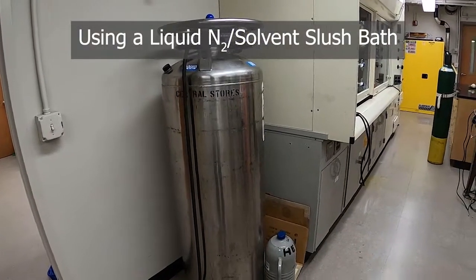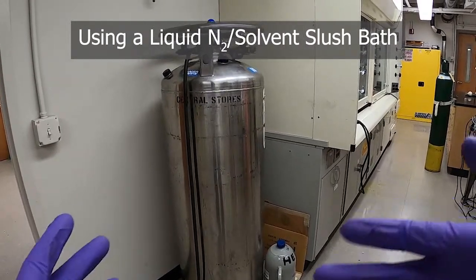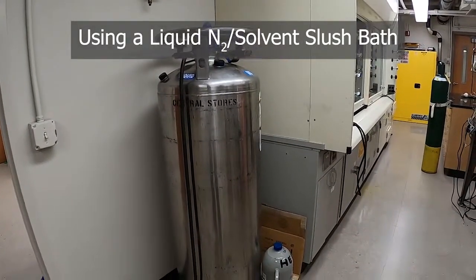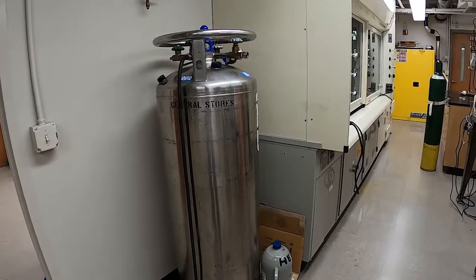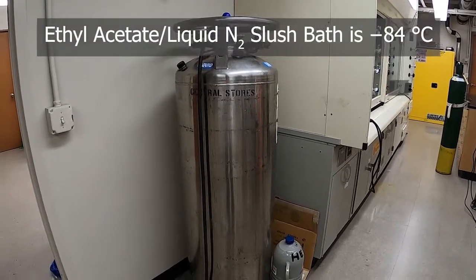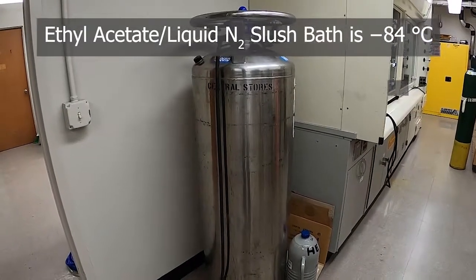There are many other types of cooling bath we can do that use a solvent and something to cool it with. Liquid nitrogen is another common way. A liquid nitrogen combination with another solvent is a really common method. One of them that gets really close to dry ice and acetone is liquid nitrogen and ethyl acetate. So if you can't get dry ice for whatever reason, that's a good alternative. I think there's only a few degrees difference between the two.